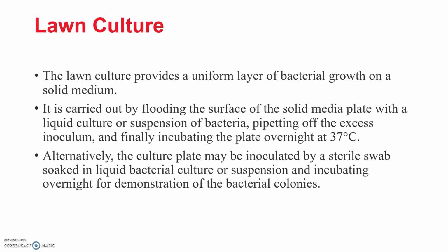So instead of flooding the surface of the solid media with liquid culture, we can take a sterile swab, dip it in the bacterial growth suspension, and apply it on the surface. And this can be done while we are performing antibiotic sensitivity test.